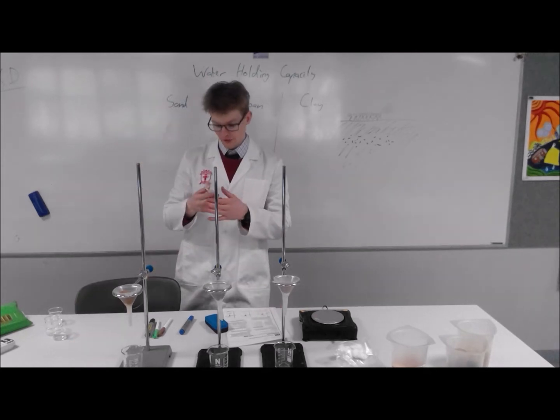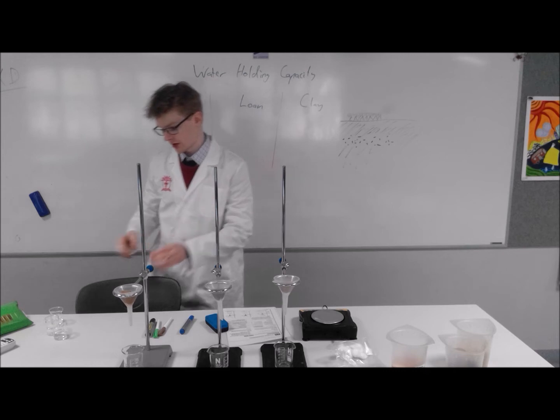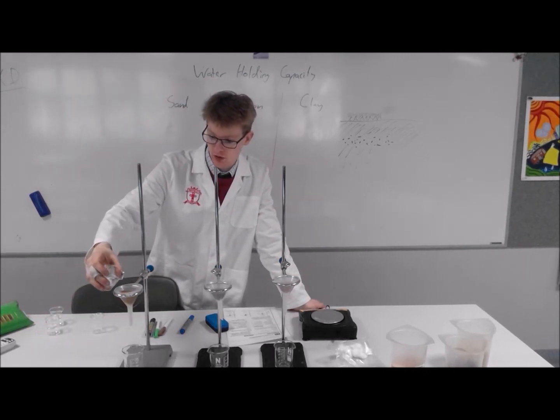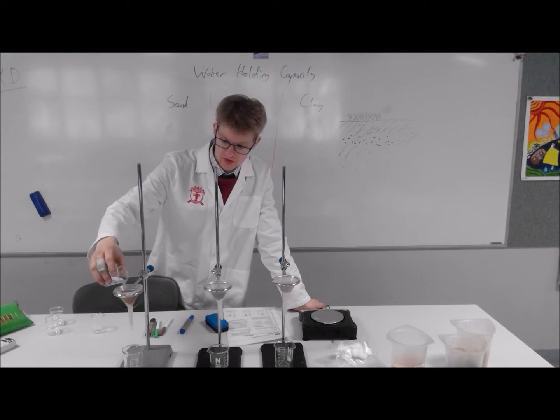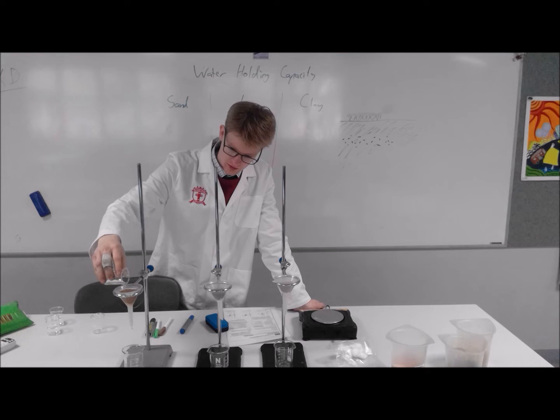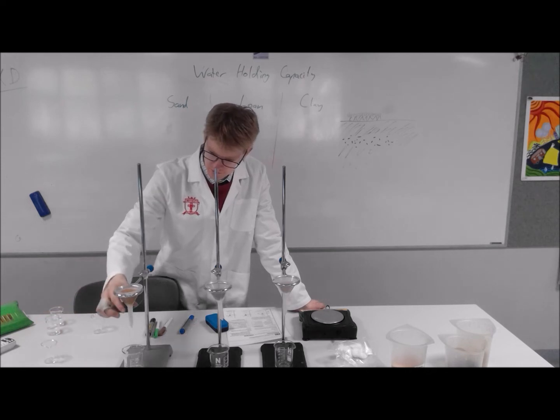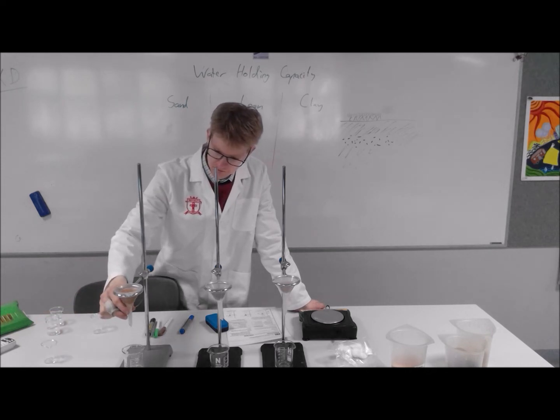Now, it's fine for me to go back and pour more water into the sand, as long as I remember how much water I've poured into the sand initially. So this is my second 20 mils. So far I've poured 40 mils into the sand. So we're still seeing some water coming through.